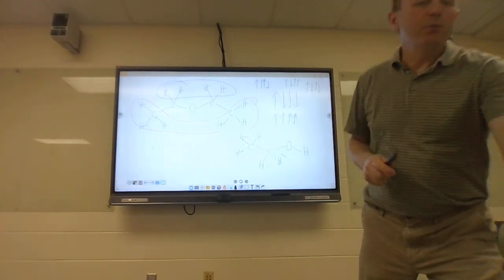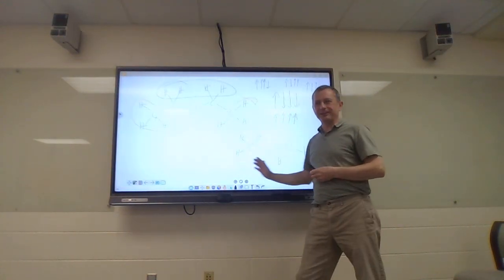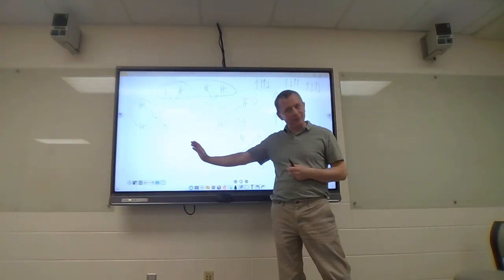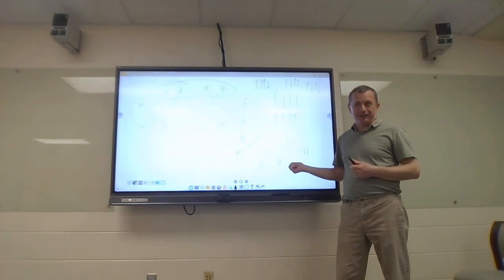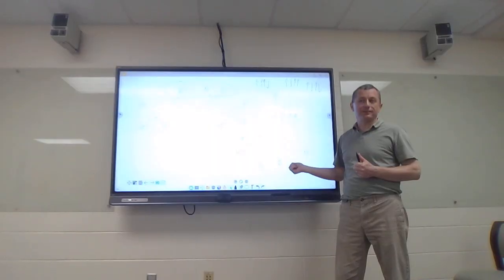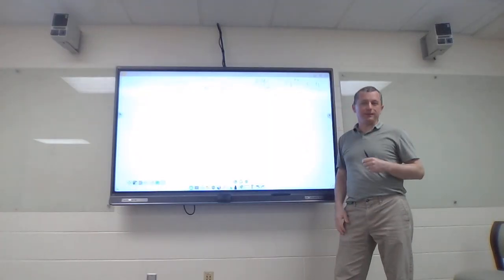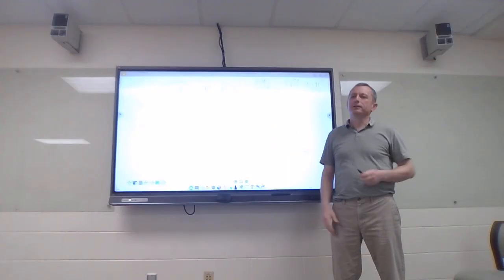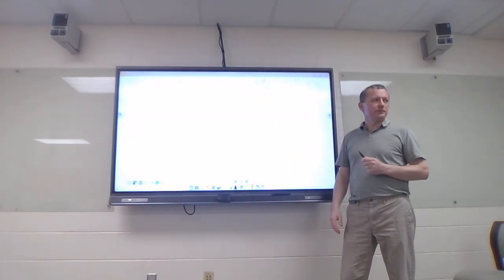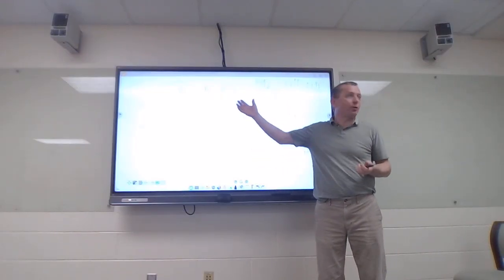complicated. So what I would tell you is, this is why I say, when you're analyzing your structure, get the chemical shift first and the integration right, and there's really only one way you could have drawn that, whether or not the splitting made any sense at all. Okay? You'll end up with the right answer, even though the splitting looks crazy, because there are going to be examples as we go on where the splitting can be really, really nonsensical. We give you the idealistic perfect world version. Well, it's always n+1.